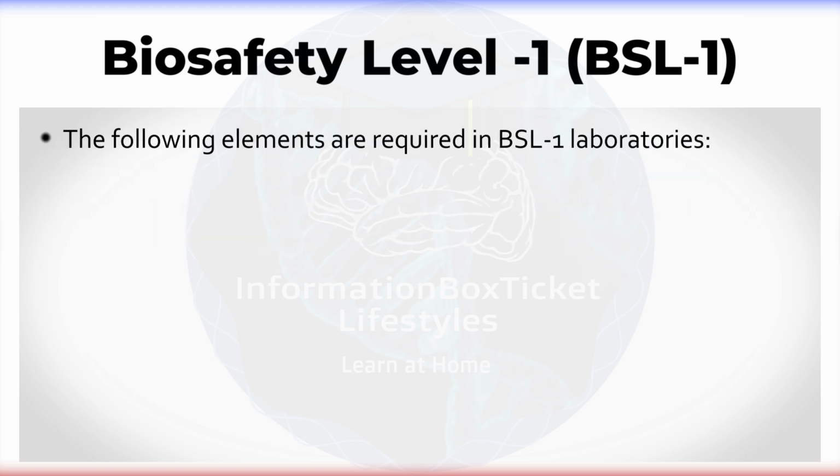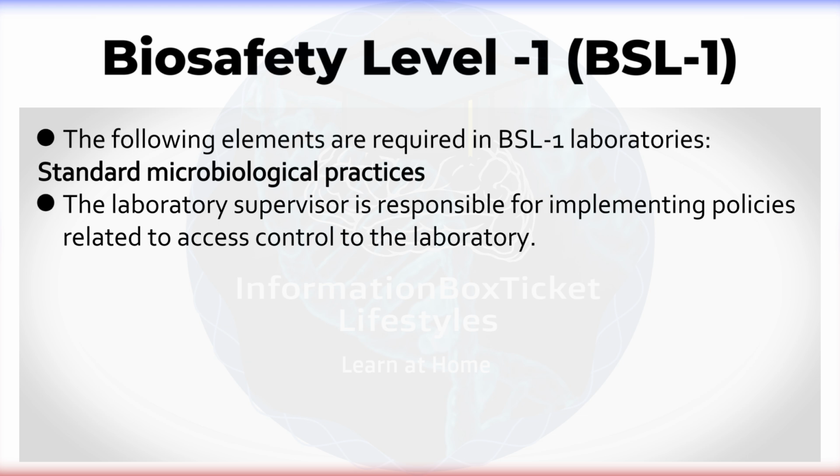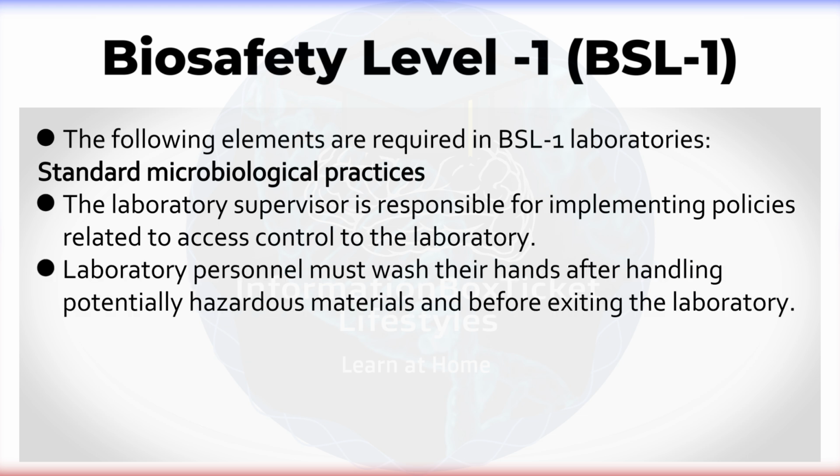The following elements are required in BSL-1 laboratories: Standard microbiological practices. The laboratory supervisor is responsible for implementing policies related to access control to the laboratory. Laboratory personnel must wash their hands after handling potentially hazardous materials and before exiting the laboratory.